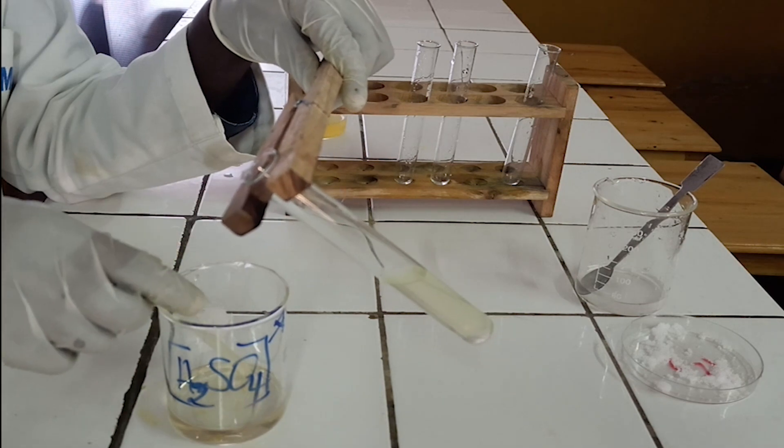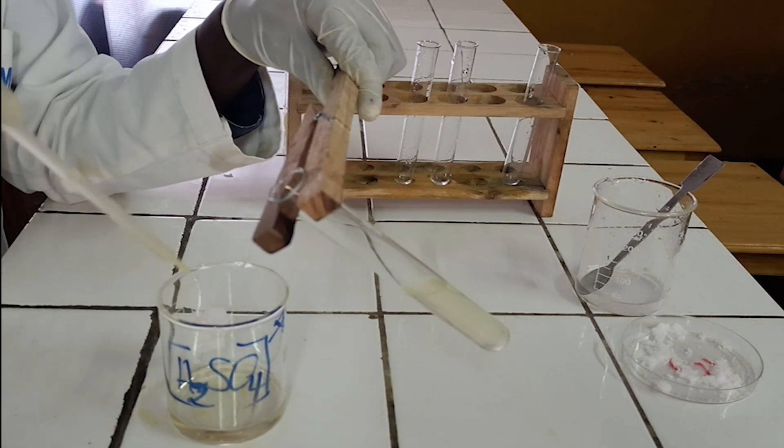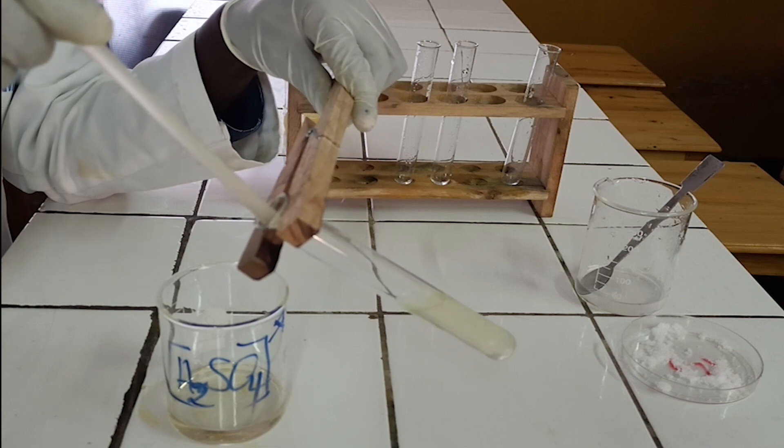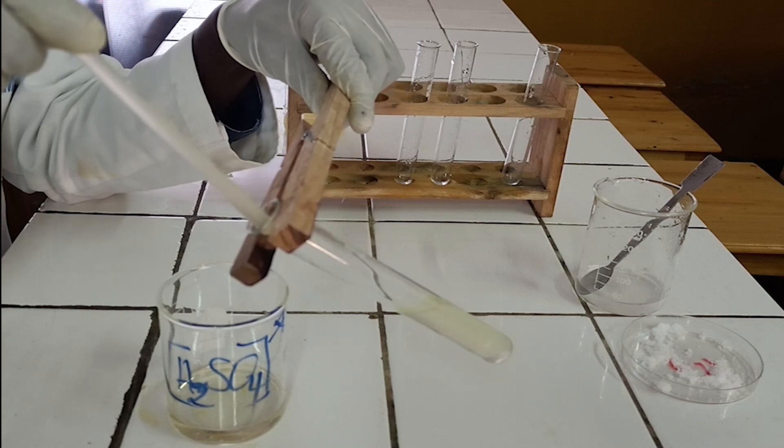Hold the test tube in an oblique position, then add concentrated sulfuric acid drop by drop down the wall of the test tube.